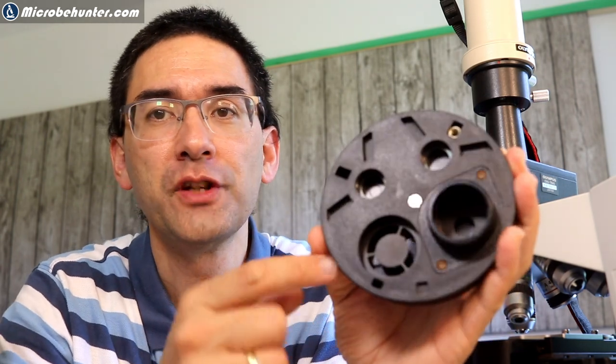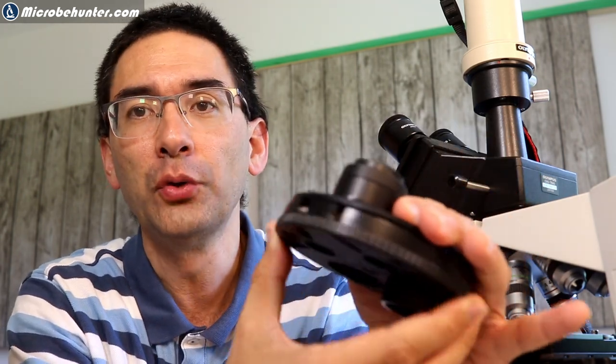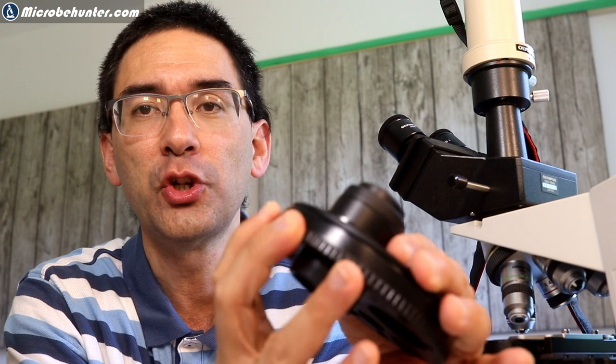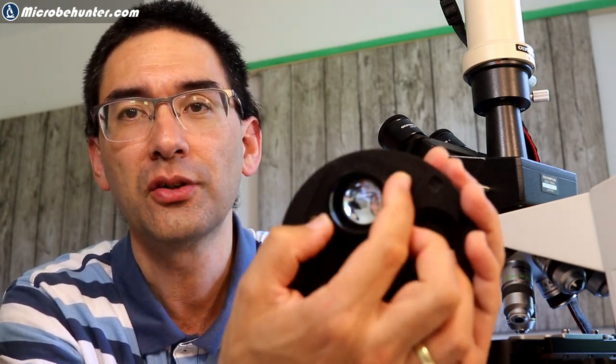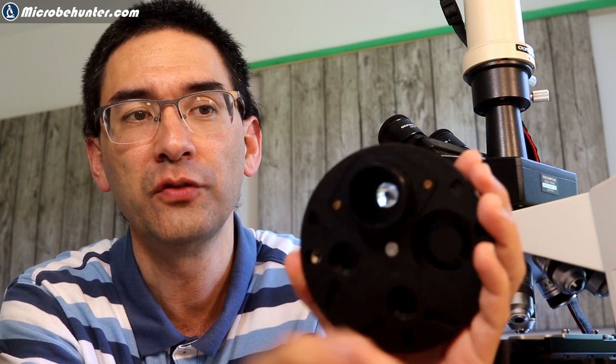It actually has four functions. If you look down here, by rotating the turret here, you can switch the functions. This one here is the regular bright field. That's the condenser diaphragm here, just a conventional bright field.